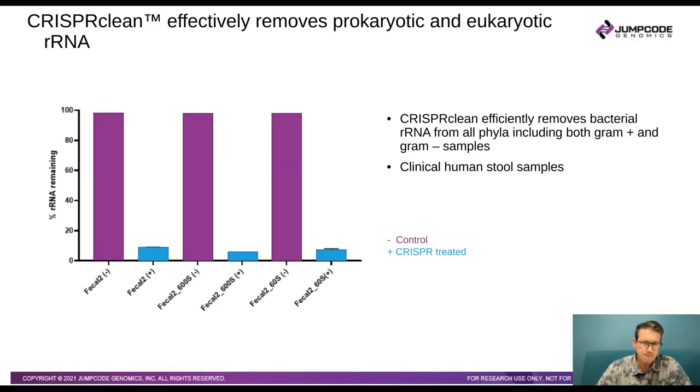And so when we take a look at the y-axis, what we're looking at here is 3 fecal samples with and without depletion, and then looking at the percentage of ribosomal RNA that's remaining in those samples after sequencing. Where we have a control sample that's non-depleted, of course, the total ribosomal species in a stacked bar plot is going to make up 100% of the ribosomal species.